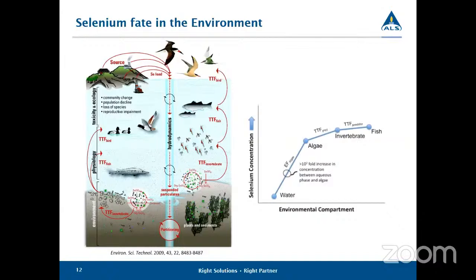That's because we're using an ICP-MS, so it's element specific. So all the peaks are selenium. They're not from any other metal or any other compound. That is an advantage of the ICP-MS side of the instrument. I know with very large certainty that these are all selenium. If we had some compounds that might contain selenium and sulfur, I can actually confirm it by looking and seeing if sulfur is also in that exact peak. But yeah, it's specific to selenium.